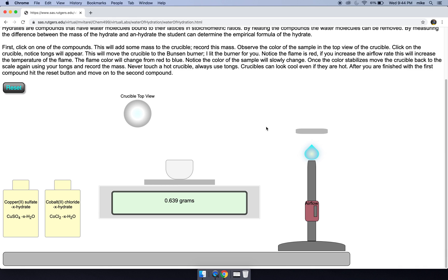So 0.639 grams seems like our mass of our anhydrate, with no water in the sample.